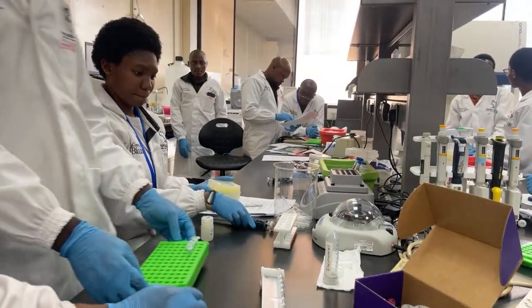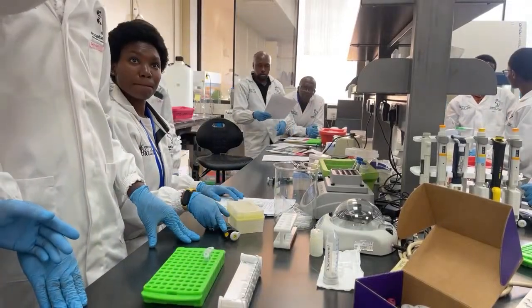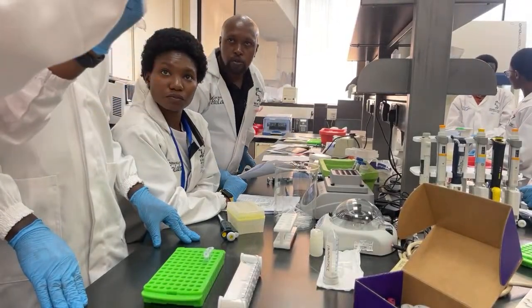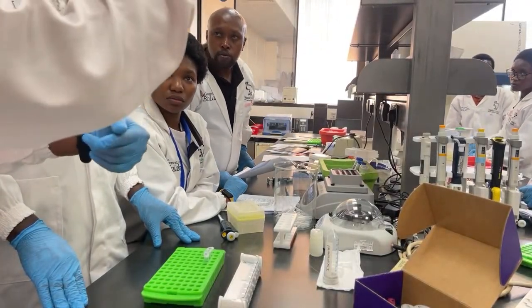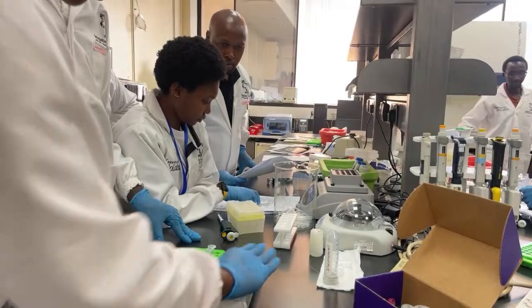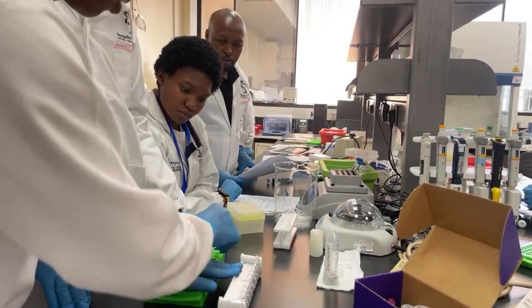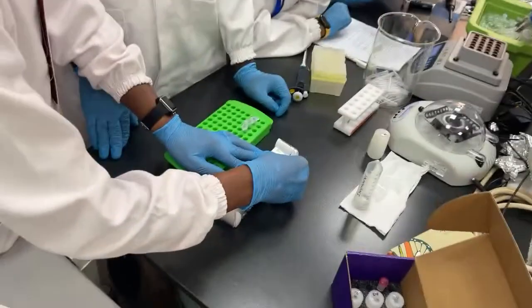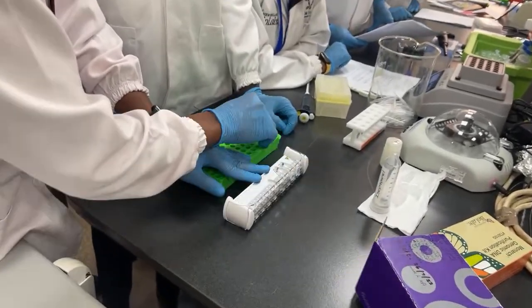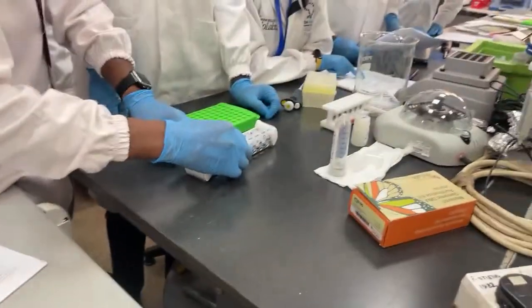So in this stage, obviously when you look at this, the disc is just above and the liquid is at the bottom. So you can't get to the liquid to remove the excess liquid, right? What they say is, with the side up, you slide in the tubes. At this stage the disc is still blocking the bottom.